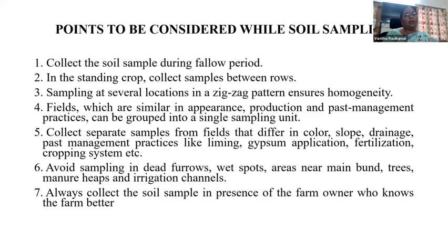Regarding drainage, do not take the soil sample in sloping areas or water stagnated areas. Near farm waste material, do not take samples. Wet spots, furrow lands, bunds, manure heaps, and irrigation channels are fertile areas, so do not take samples there.